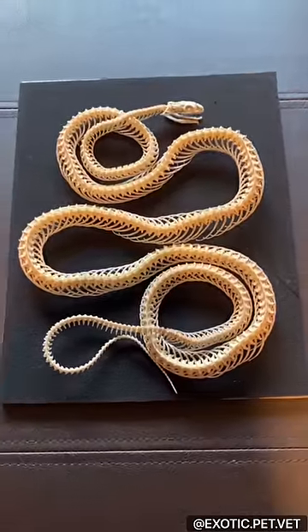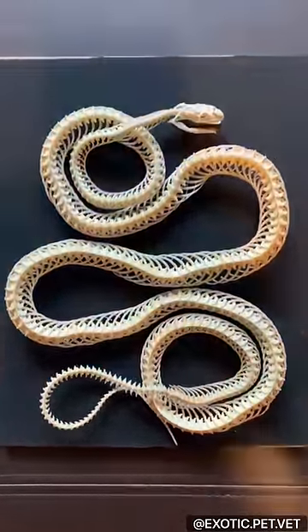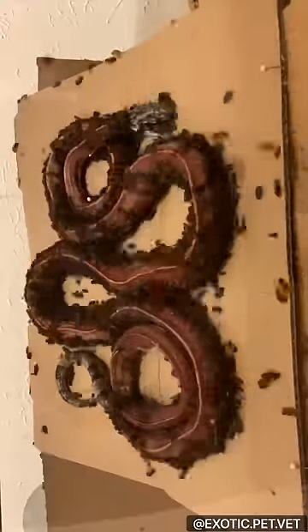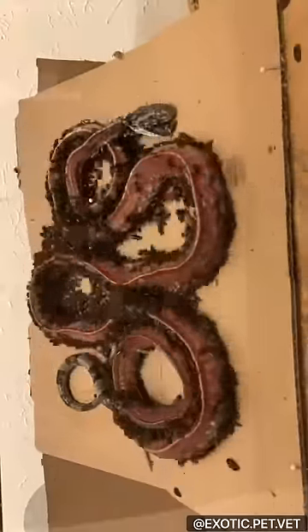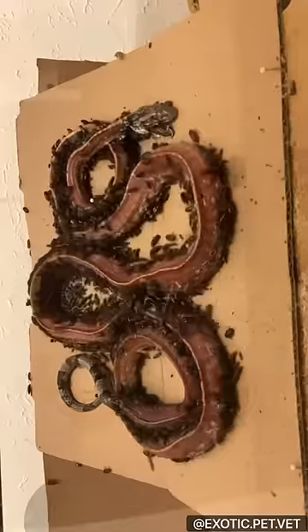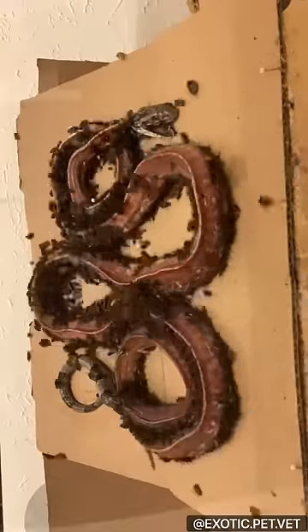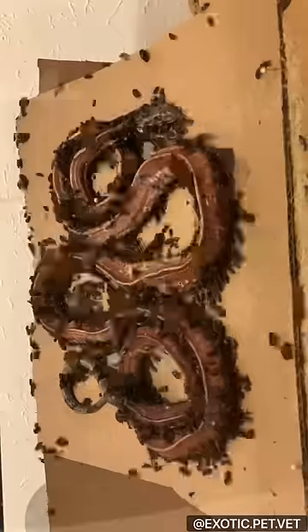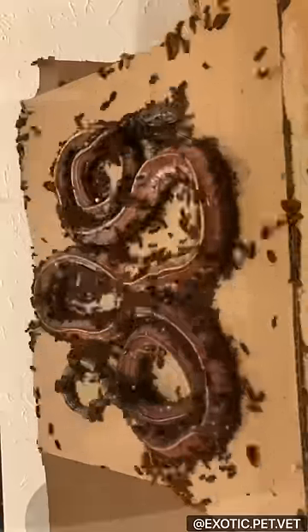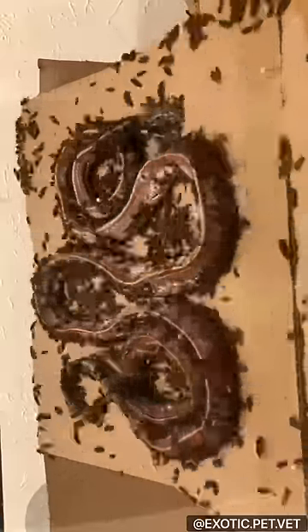Let me show you how I used my dermestid beetle colony to clean this corn snake's skeleton. After this snake passed away from natural causes, the owner gave it to me for preparation. After removing the skin, muscle, and internal organs, I left it out to dry for a day. This dehydrated the specimen in the exact position I wanted it to be cleaned in, so that I would not have to reposition and re-articulate it afterwards.